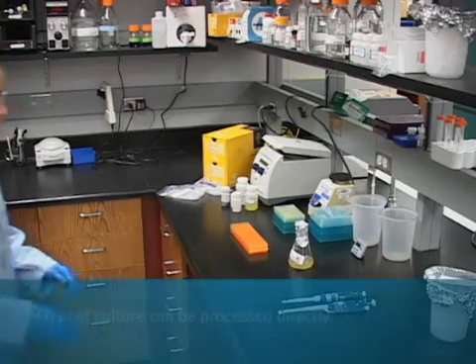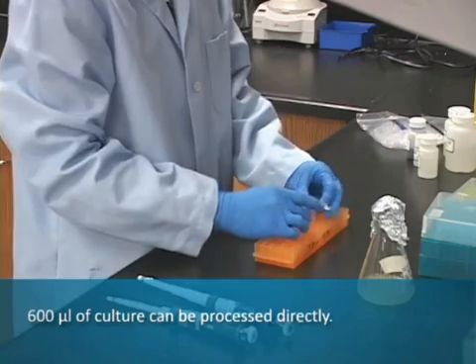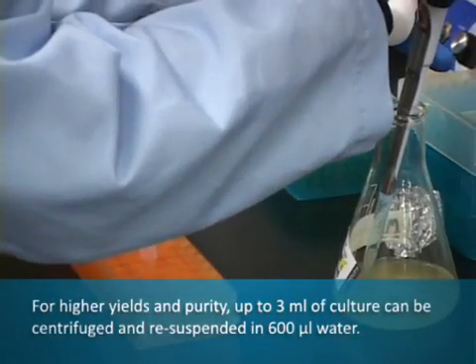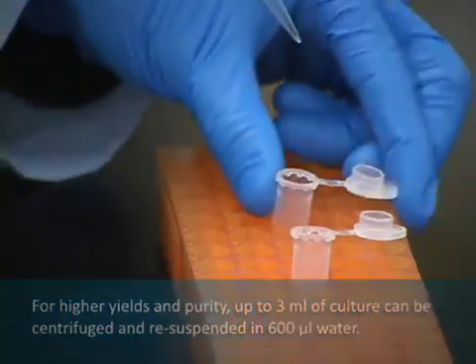Using the Pure Yield Plasmid Mini-Prep System, you can directly process 600 microliters of bacterial culture. For higher DNA yields, up to 3 mL of culture can be centrifuged, and the pellet resuspended in 600 microliters of water or TE buffer.